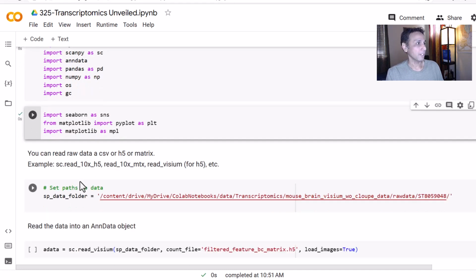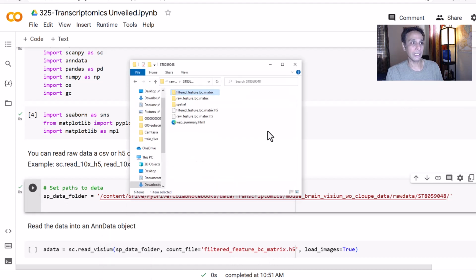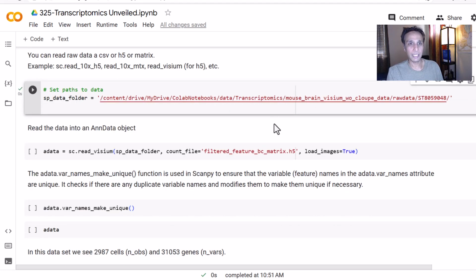What I mean is pandas. Okay, now that we have these, I placed this entire data set on my Google Drive, and I've already connected that. So all I'm doing is pointing this to the data directory. I'm just looking at one data set right now. In reality, you may want to load all of these and then perform individual statistics, but then combine all of those. It depends on how you devised your experiment, basically. Right now, we are only looking at a single one.